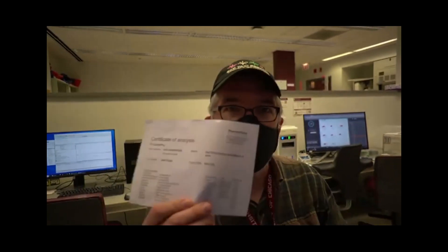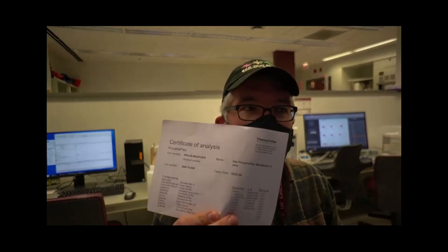This is a quick introduction to the Luminex software. We're going to see how you can use the software to enter the information about your experiment. Things that you are going to need include the protocol booklet, as well as the certificate of analysis that came with each of your kits.